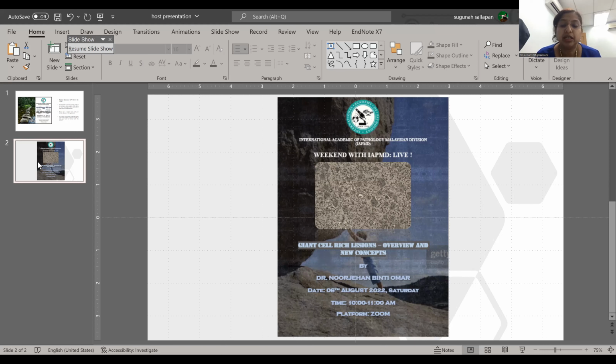Okay. Number two, if you want to do a pronase digested paraffin section, you can do, provided you think that this is really relevant. Now, if you can't do it, then please give a pattern of injury description. That means pattern of injury interpretation, like I have already described to you.